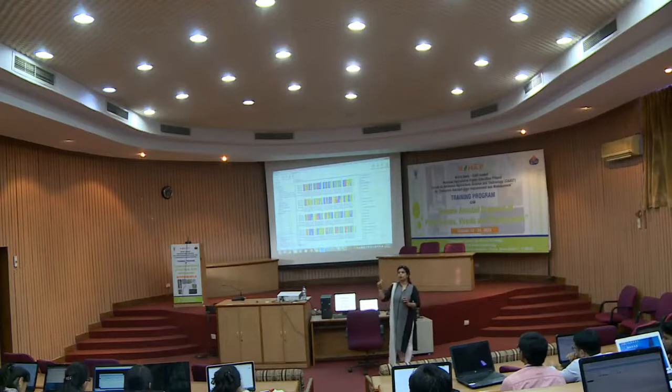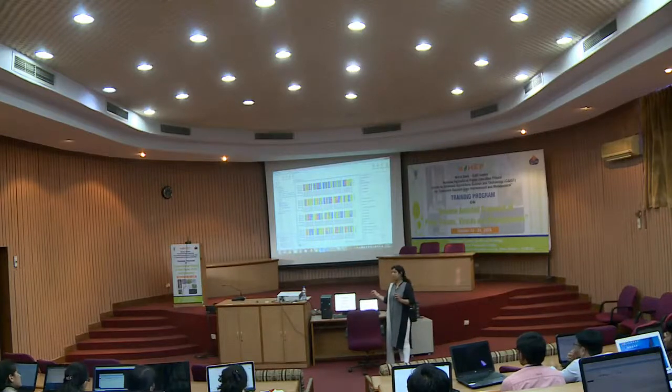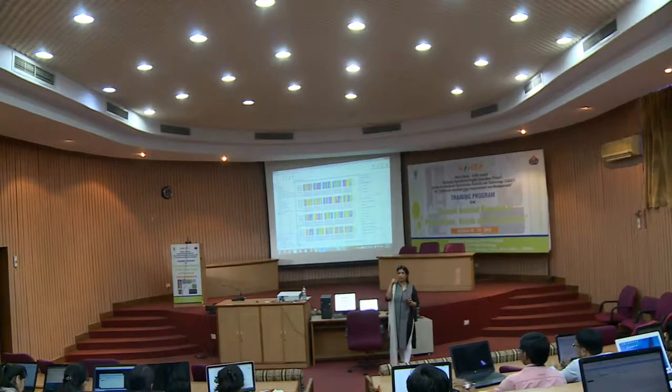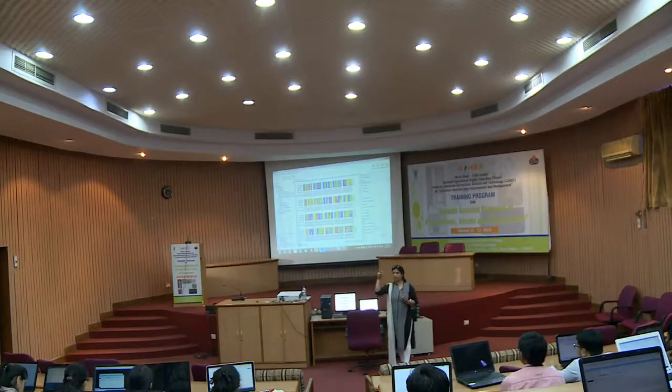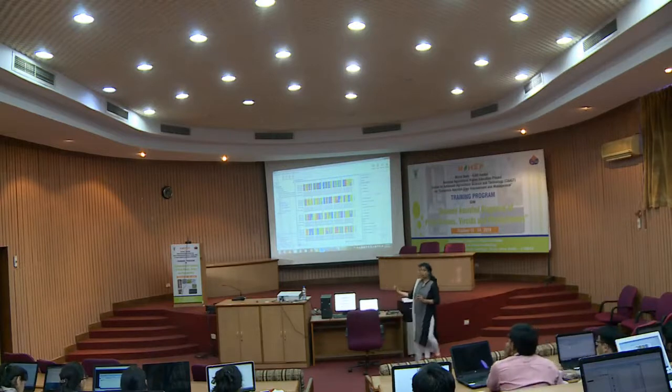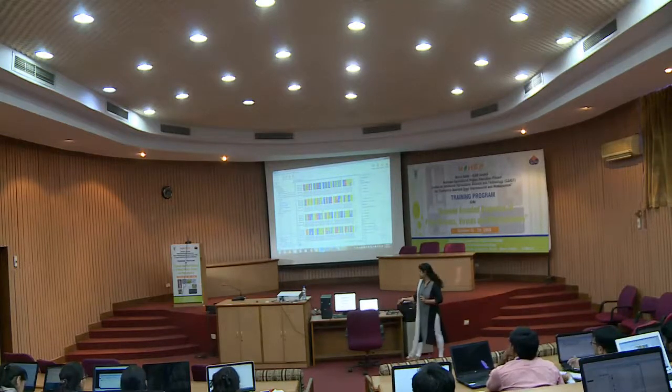Okay. For the 10 sequences, you will make Contigs, like I just told you. Put them in a single file in FASTA format: FASTA format, sample 1, let us suppose gene A; FASTA format, sample 2, gene B; 1, 2, 3, 4, just one after another, you paste the sequences and convert it to a text file. Then the text file you can import here in this CLC software.